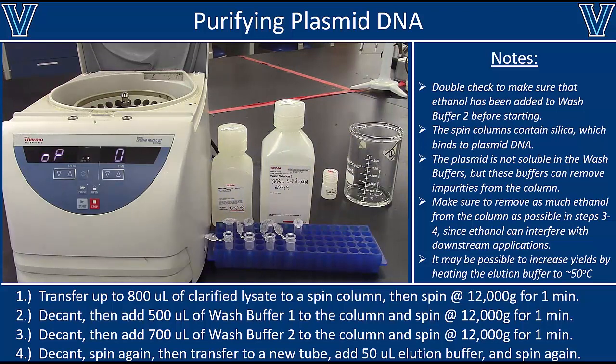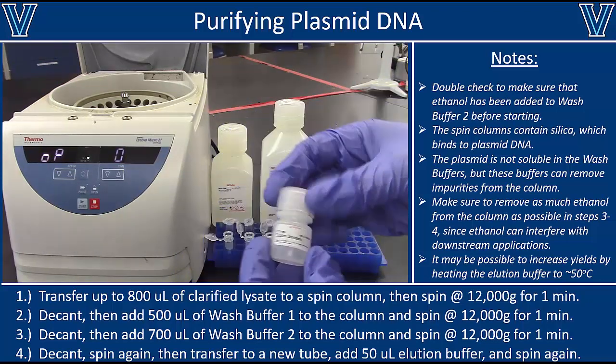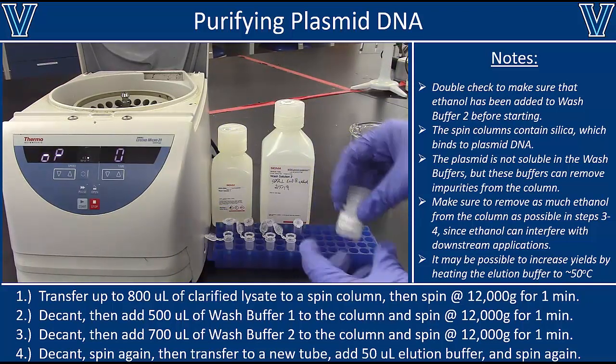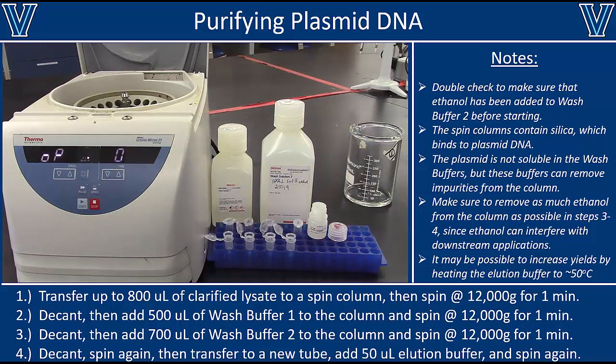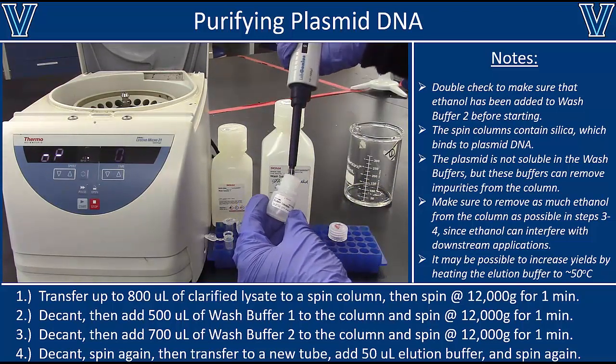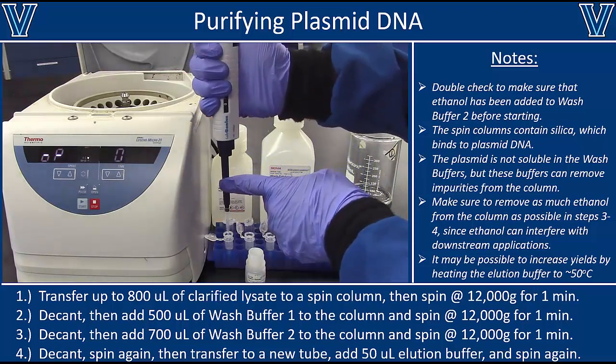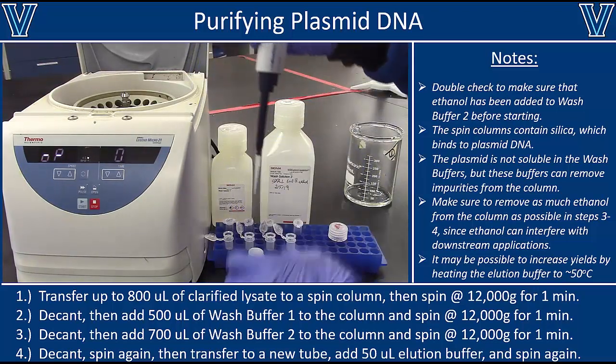All right, so we're going to load those spin columns into those tubes, and then we're going to put anywhere from 25 to 100 microliters of elution solution onto those columns. Now what you want to do here is be very careful to add the elution solution directly to the middle of that spin column. You want to make sure that you get the liquid onto the resin.